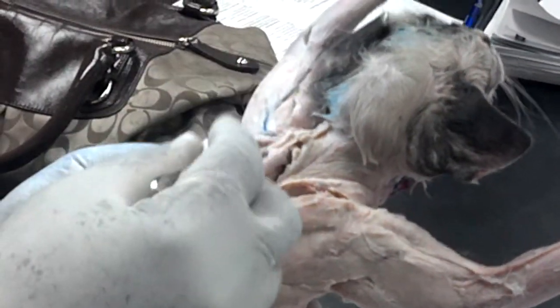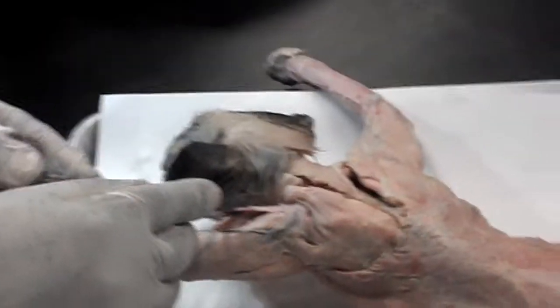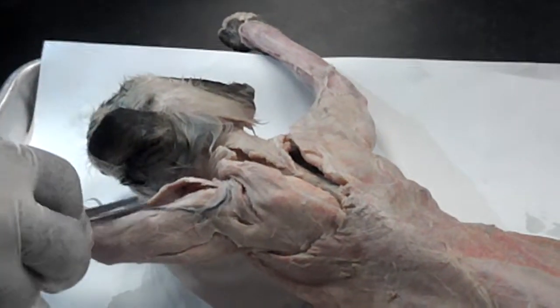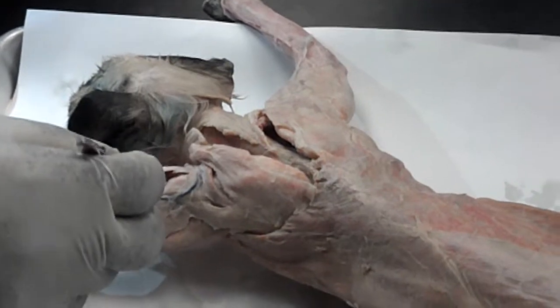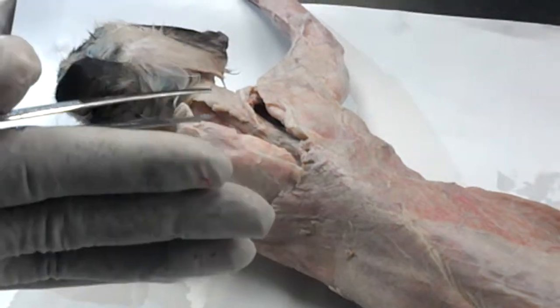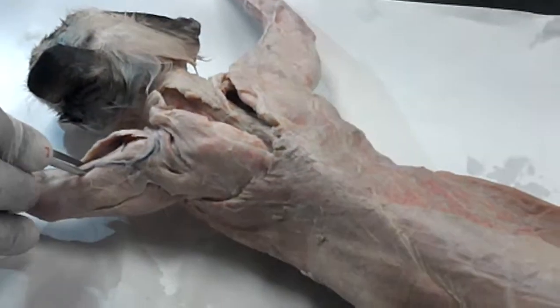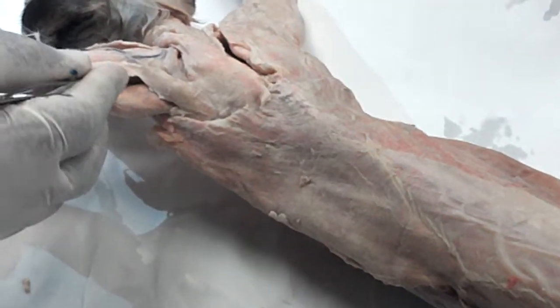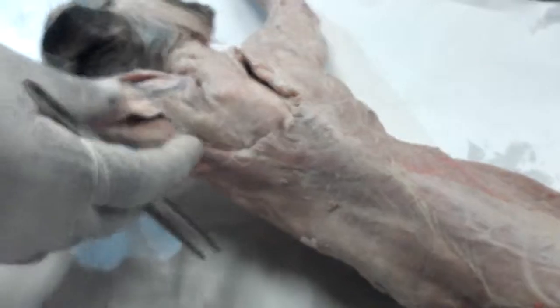Now, let's see. Deep here on the arm, we're going to have to identify this one muscle. This is the brachialis. That brachialis again is a little bit lateral. So we're going to identify the brachialis. We already identified the medial head of the triceps brachii, and we also find this here after we reflect.